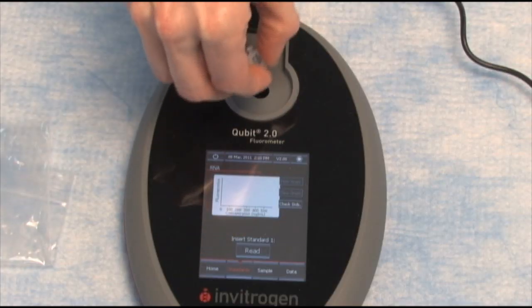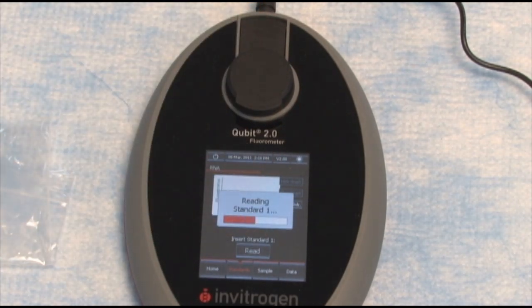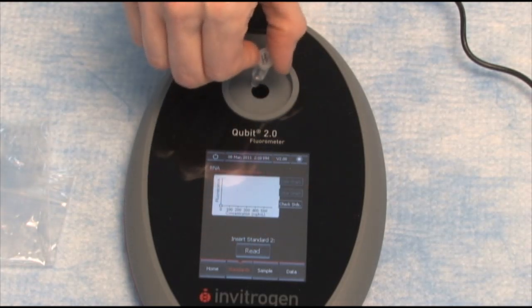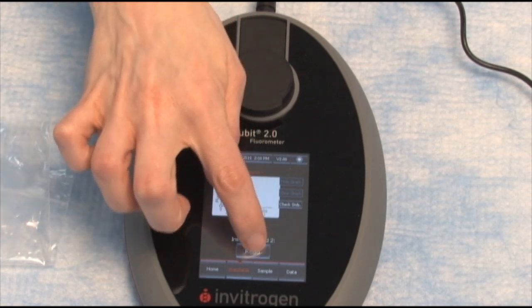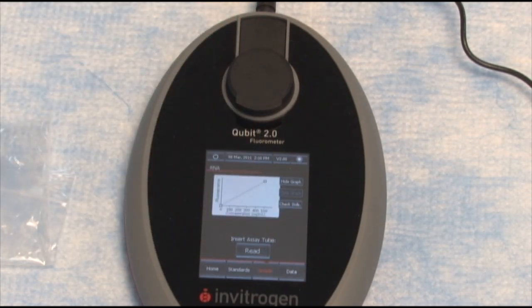So we'll open the Qubit, insert standard one, and press read. Simple enough. Now let's go to standard two — insert into the Qubit, press read. Simple enough. We've got our standards done.